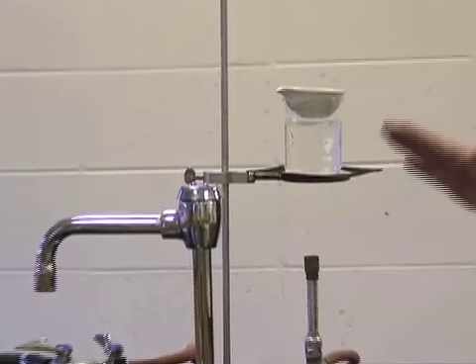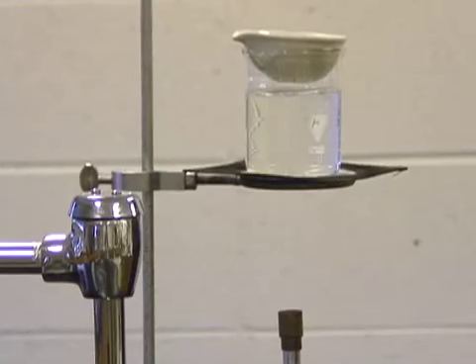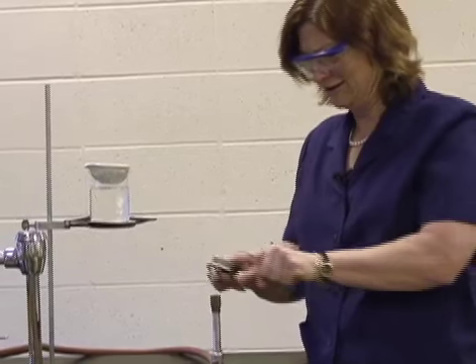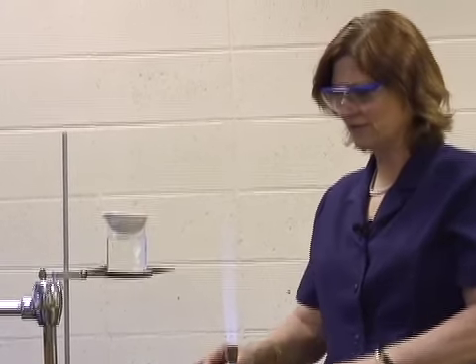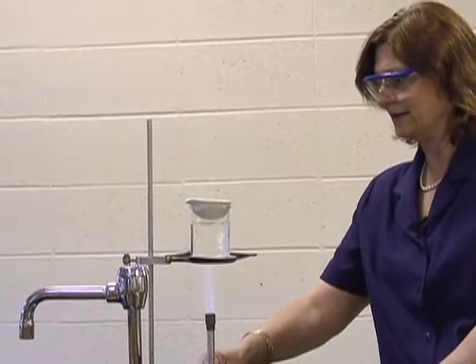We do not want the Bunsen burner flame to go directly on the evaporating dish. We want to be gentle. And therefore, we are going to use a steam bath. And I'm turning on the gas and lighting the Bunsen burner. Sometimes it's more challenging than others. And it is a little bit high there, so I'll turn it down a bit. And we will go ahead and heat it.